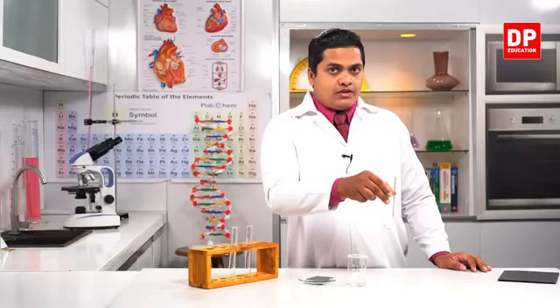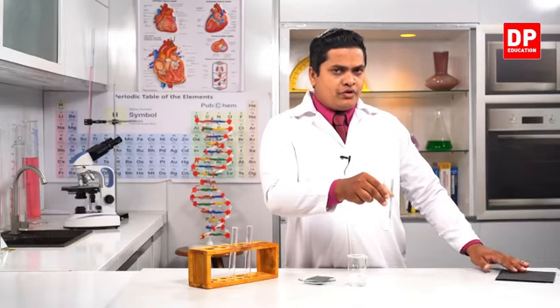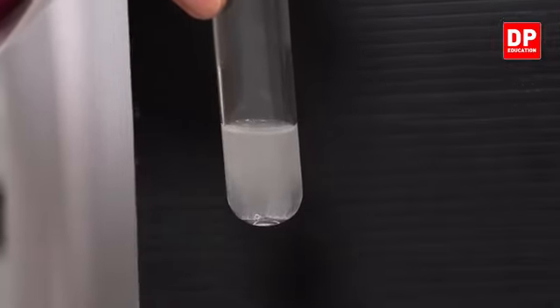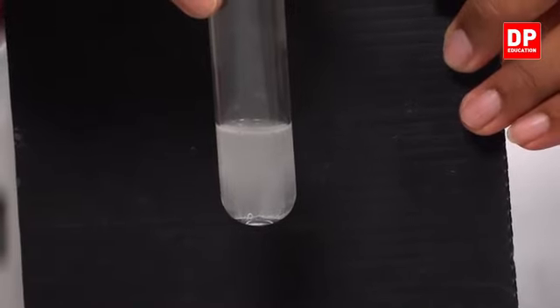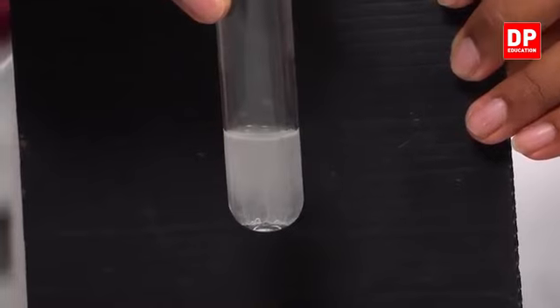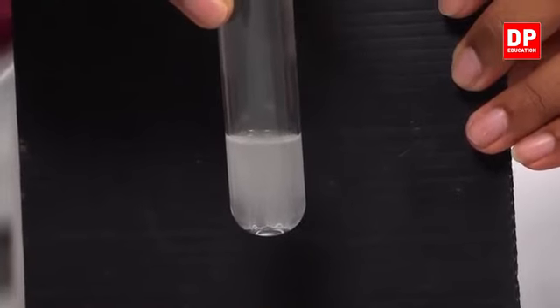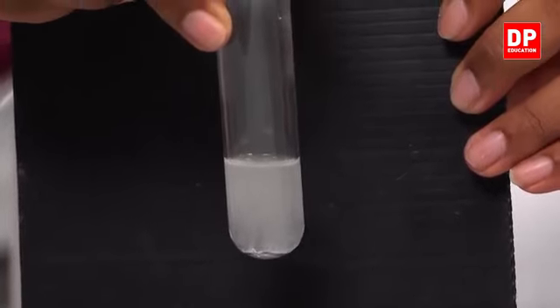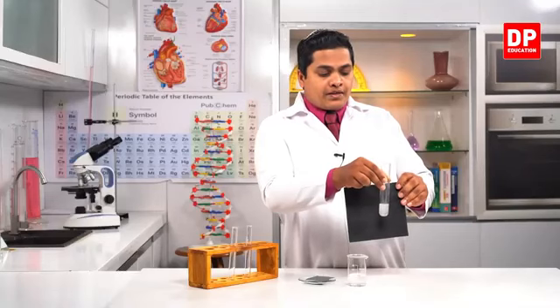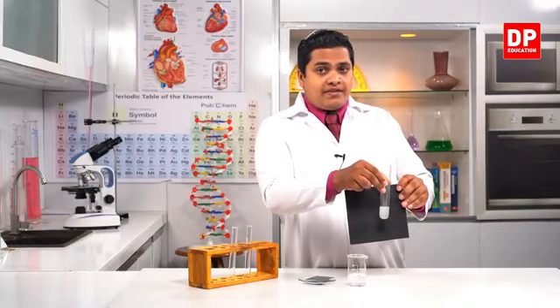My dear children, to get observations more clearly, I am going to use a black color background. See? So when I'm using this black color background, you can observe the gas bubbles very clearly. Now the gas which is getting emitted in this situation is hydrogen gas, right? So this is another type of evidence.